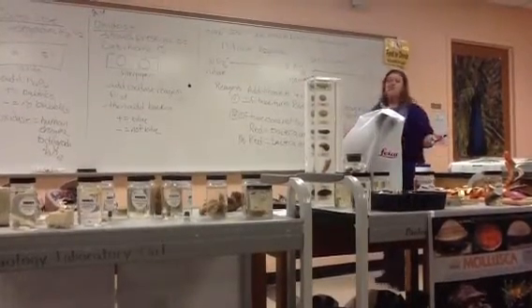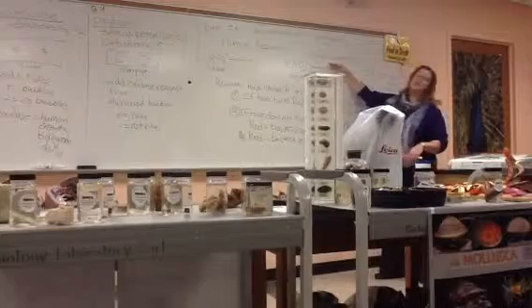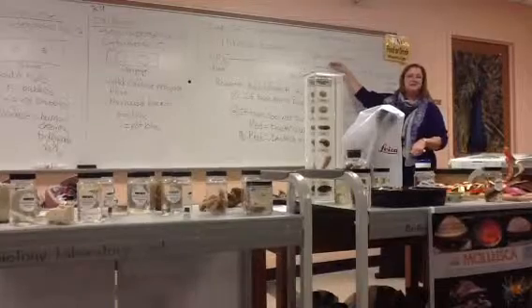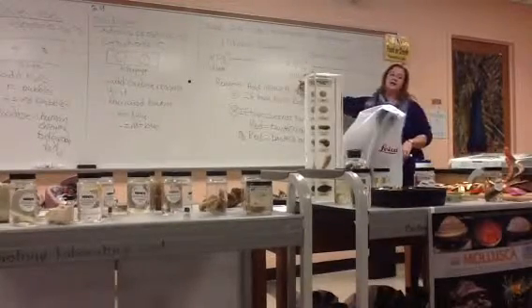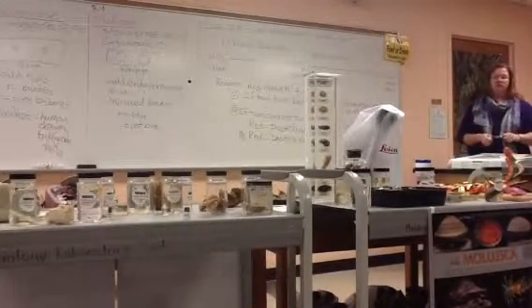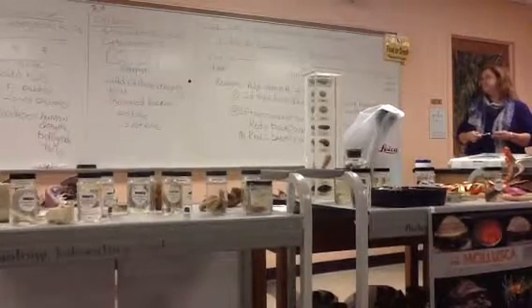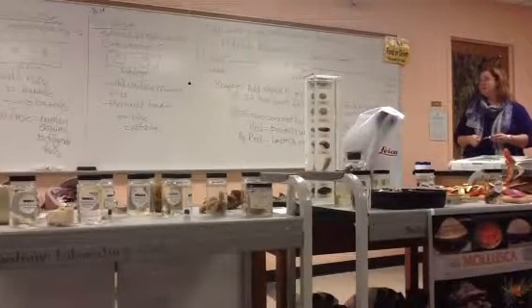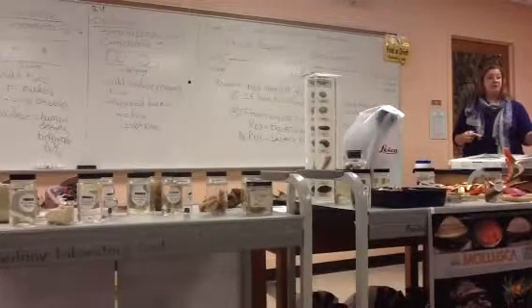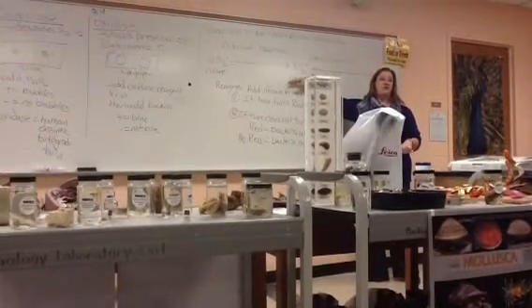Then some bacteria, after doing nitrate respiration, after converting nitrate into nitrite, can go through a second process called denitrification. These are all bold words in your lab book here as well. Denitrification. And that is the process of converting nitrite into nitrogen gas and nitrous oxide. So denitrification converts nitrite into nitrogen gas and nitrous oxide. Some bacteria can do only nitrate respiration, convert nitrate into nitrite, and then they stop right here. And they're not capable of denitrification at all.